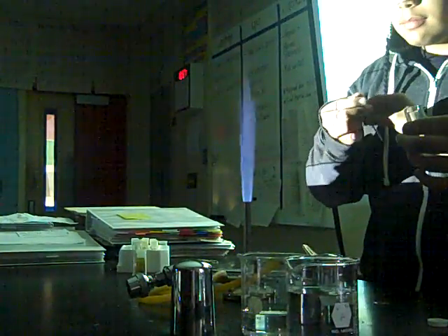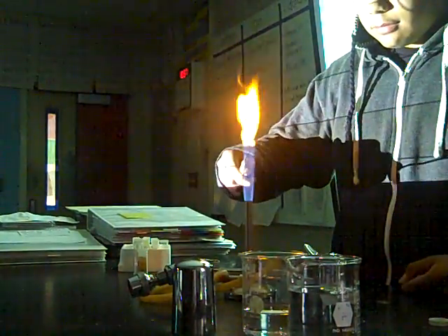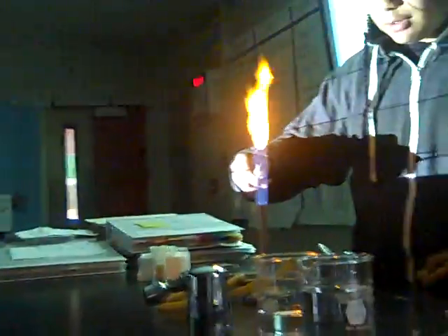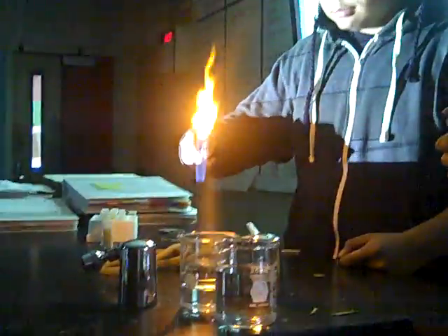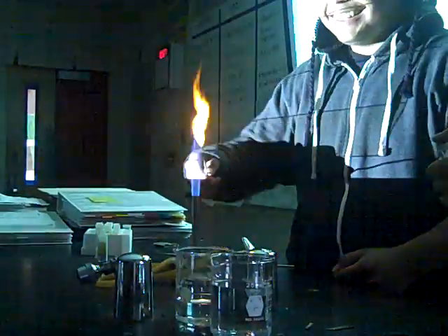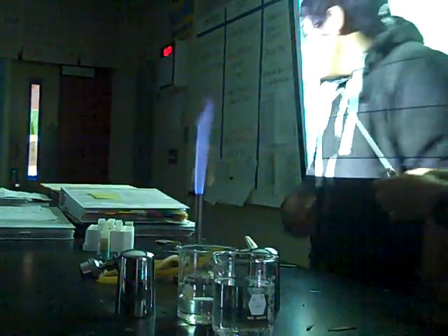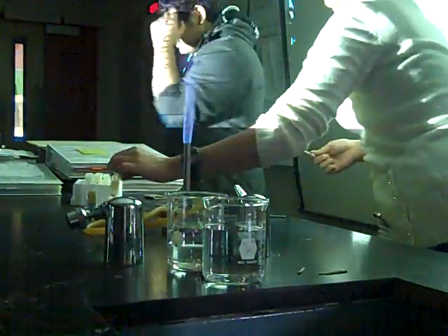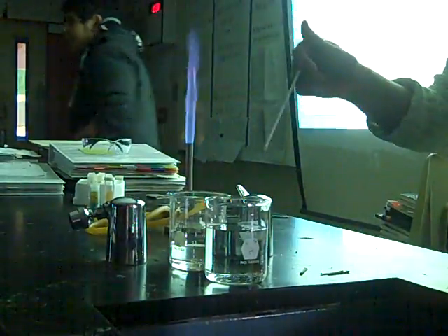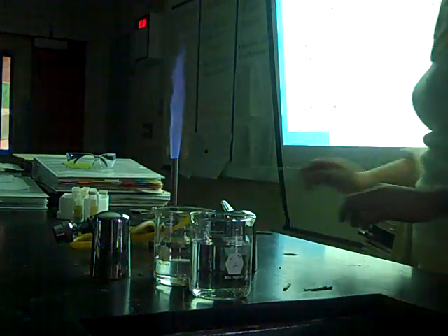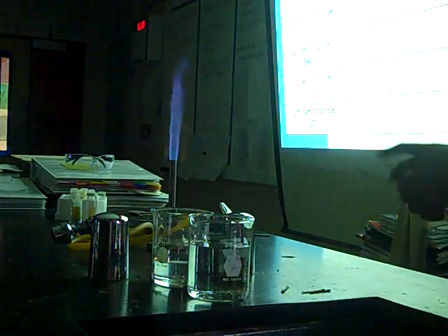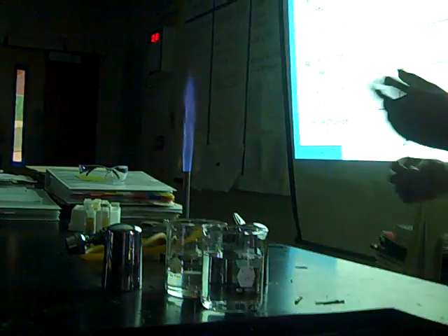Sodium chloride. Alright, sodium chloride. Thank you. Want to leave the glasses? Okay! Potassium chloride. Who wants to do potassium chloride? Guillermo?